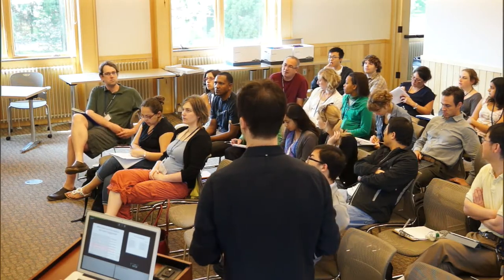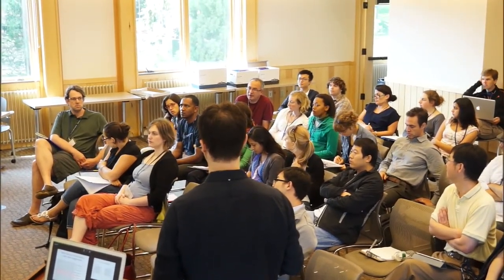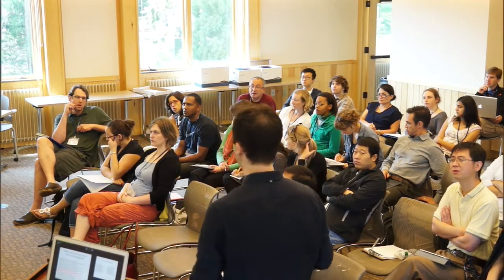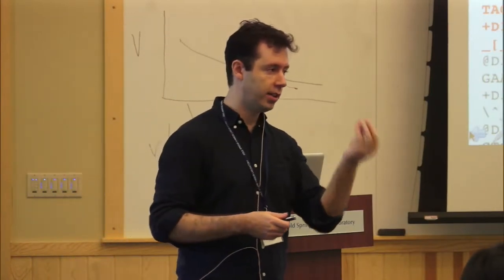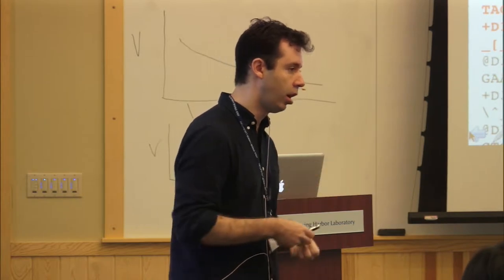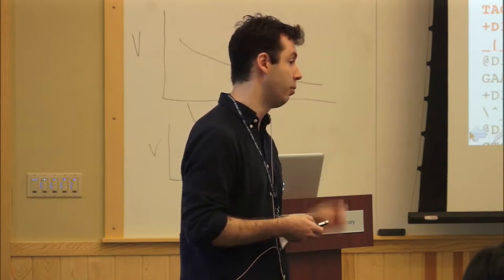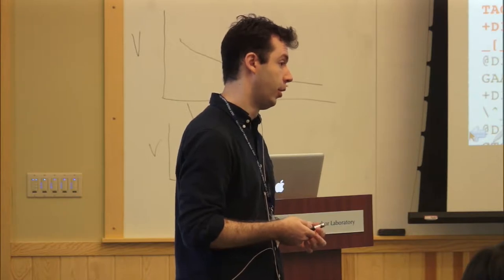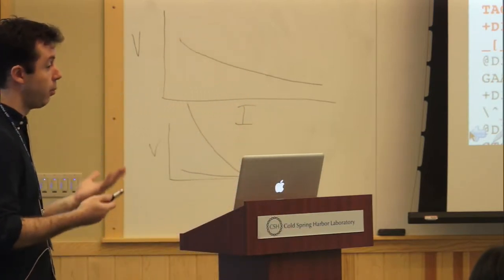Yes. I mean, there's two questions about PCR or duplicates. Something that we've thought about. You can have two sources of duplicates. You can have duplicates that come from the library prep. You can also have duplicates that come from the cluster. Yeah. I mean, most duplicates are coming from PCR. Cluster growth, at the end of the day, unless you can read two dots, well, it should be only one dot. That should give us very limited duplicates. Most of this clonality problem is coming from the PCR steps. And you can tell, if you do more PCR, you get many more clonal reads. We've seen this over and over. It's mostly the PCR.